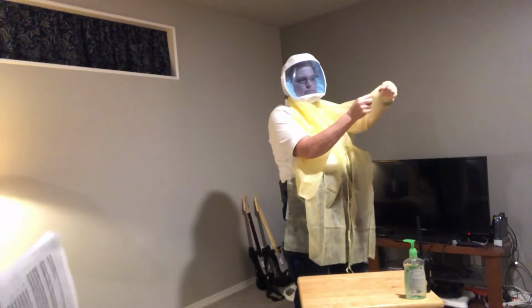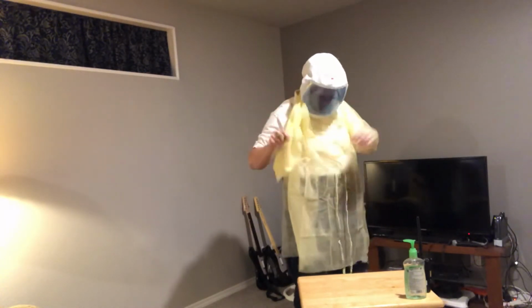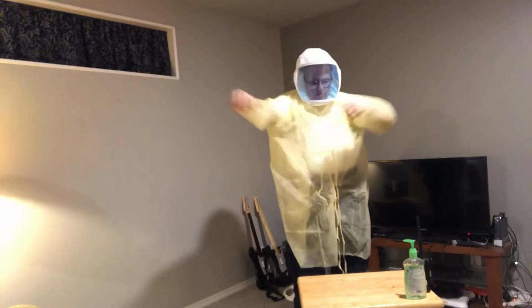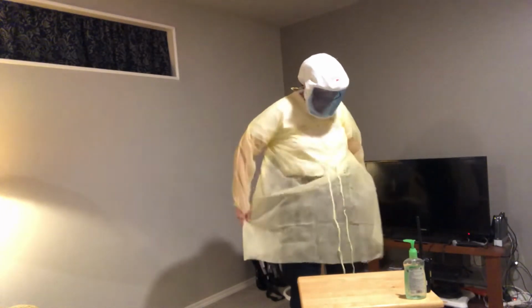All right, so she's getting her gown on. Now notice there are no thumb holes, just like our last video as well. No thumb holes in these gowns. Make some, because your gloves are going to need to go over top of the gown on your wrist and lower forearm there. So if it doesn't have a hole, real easy, just punch one with your thumb. Not that hard.